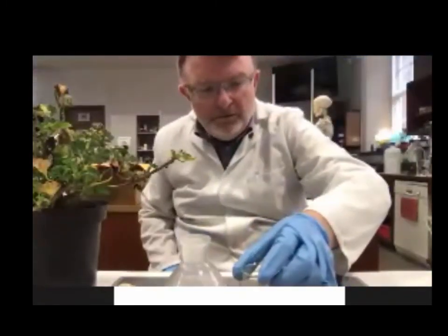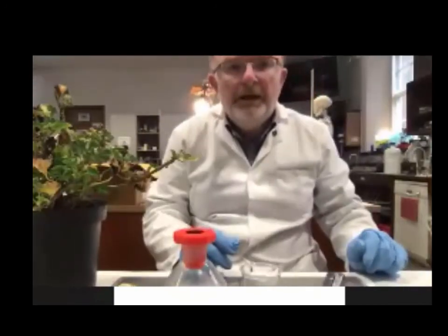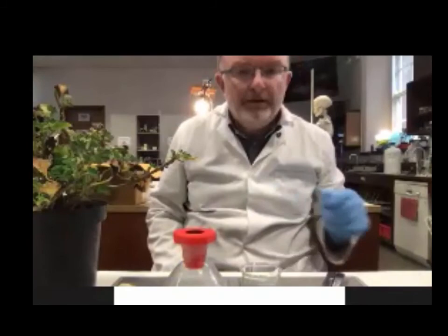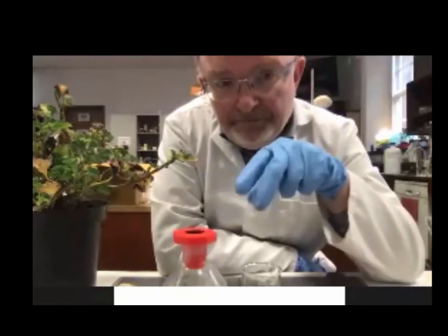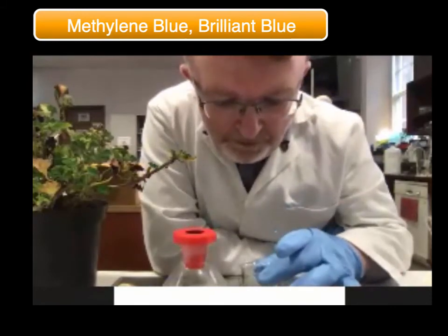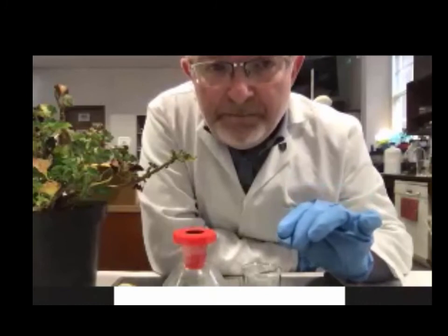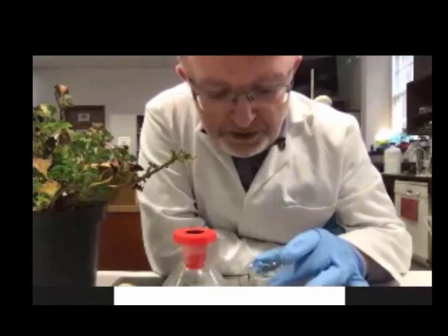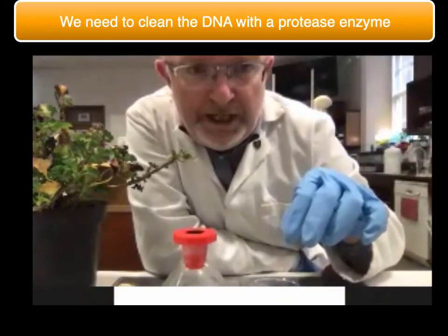Now, what if we wanted to stain the DNA in order to prove that that's the DNA? What's the stain for DNA? There are several stains, and they're usually a derivative of methylene or methyl blue. If you're staining animal cells under the microscope, methylene blue is what you're using. So we could add a blue stain. The alcohol would go blue because you're diluting it, but what we would be looking for is dark blue strands or clumps of dark blue in there. But methylene blue also stains protein, and of course the DNA is completely bound up with protein, so you're getting a lot of protein material in there as well. So the way around that is to add a protease to this.